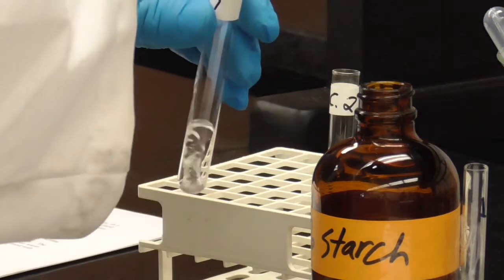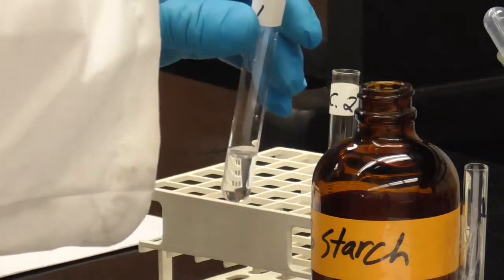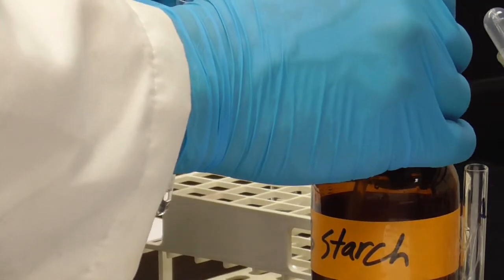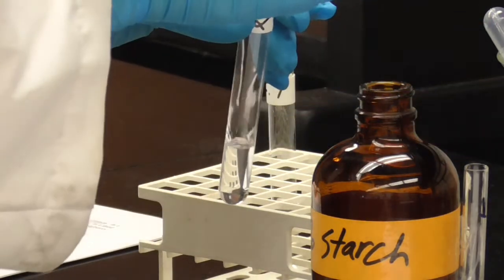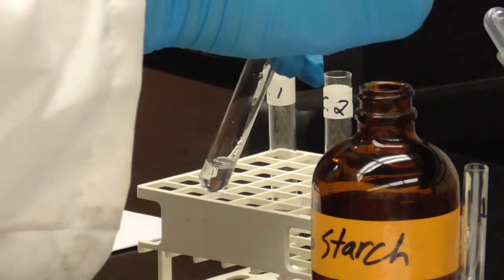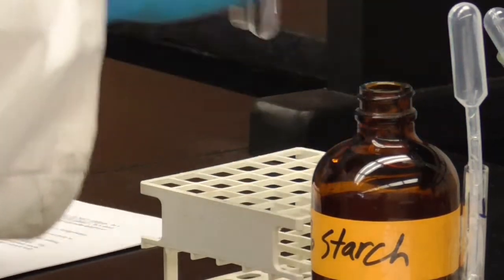Okay, so there is 1, 2, 3. Second test tube, same idea. 1, 2, 3. And the third, 1, 2, 3. And let me just make sure I got about the same in each test tube.